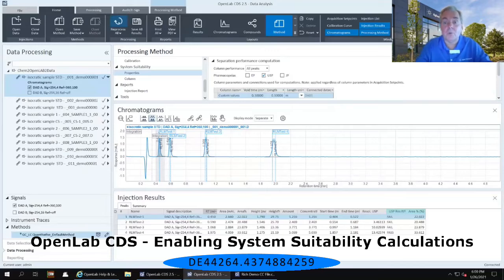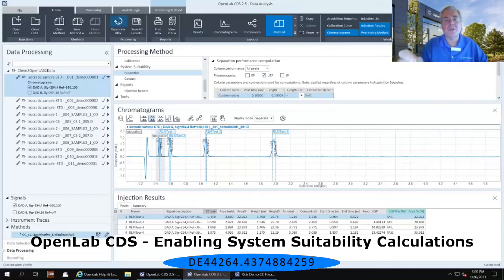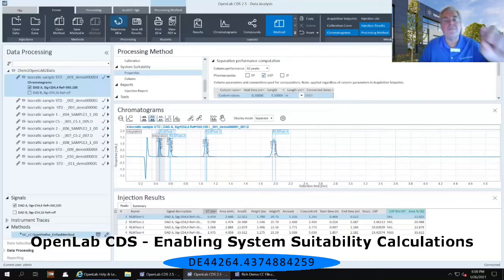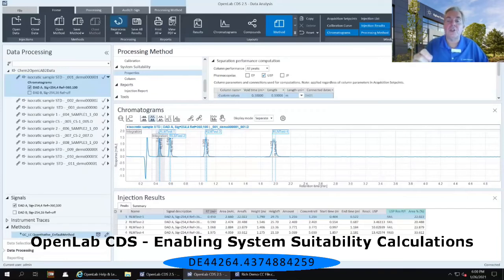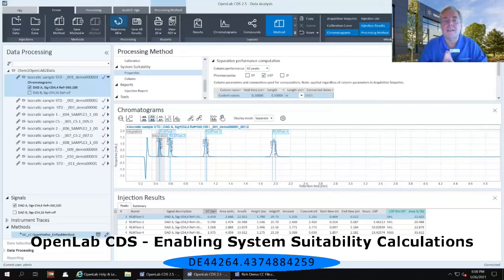Now notice down below in the injection results, we have our two custom calculation columns — the USP resolution and the area percent. Also notice our resolved USP has numerical values filled in. For the very first injection, I've got a failure on the RLM test two and three peaks because they are below my USP resolution of 13, but my last one is above the USP resolution of 13 and it marks it as passed in my injection results table.